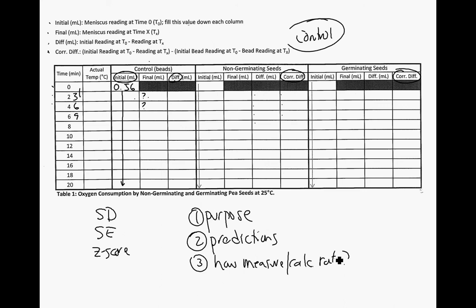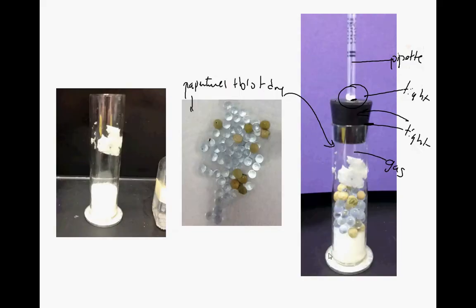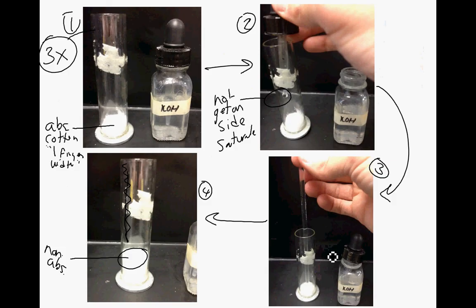One thing I did not mention that I just realized is to go back and talk real quickly about that KOH. If I go all the way back here, that KOH that you're putting in initially, you can read in the pre-lab about that KOH and what the purpose of that KOH is. Why are we doing that? Hint, it has something to do with carbon dioxide, oxygen, the ideal gas law. If you don't remember the ideal gas law, go and Google that or look it up in your chemistry textbook. Okay? Thanks. Bring your questions and clarifications to class.